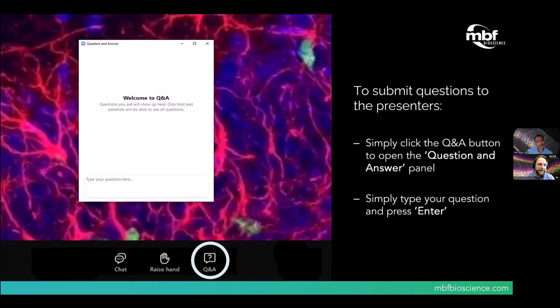Then when I'm setting up my sample, I usually like to lower my light even beyond that, just to make sure that if I do end up sitting in one position for a moment or so, I don't end up bleaching that portion of the sample. You can always increase your exposure while you're setting up your acquisition. That will give you a similar looking image quality and give you enough data to create those compensation maps and set up your acquisition.